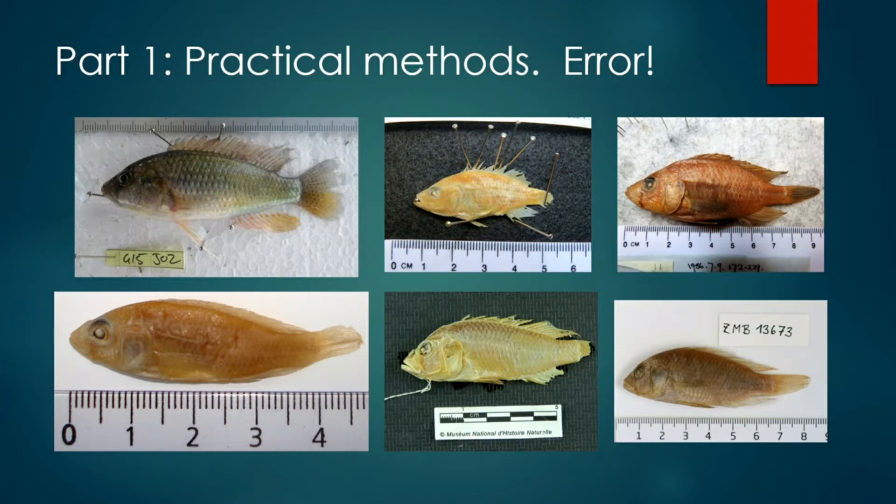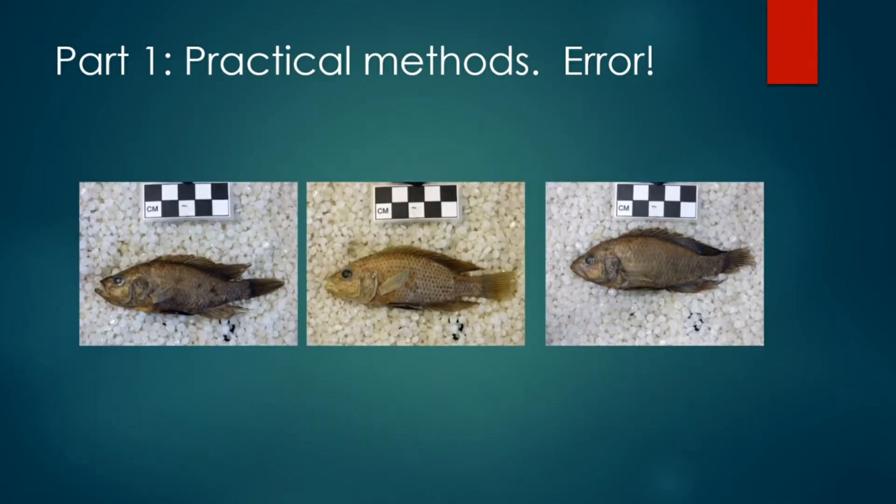Otherwise you can have your results completely invalidated and you can't be certain of your conclusions. For example, all of these photographs were taken by different photographers, different cameras, lenses, levels of zoom, and different distances from specimen to the lens. Some are angled and the scale bars are sometimes near the edge of the image, so it would be incorrect to make conclusions from results obtained from these photographs. However, these other images all have the same level of zoom and same distance from the camera, and would be suitable for comparisons.